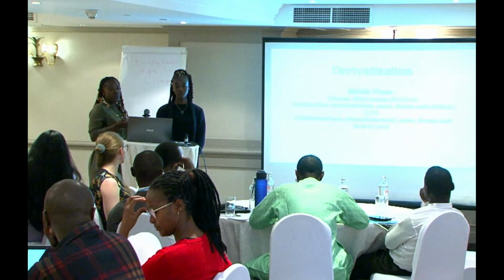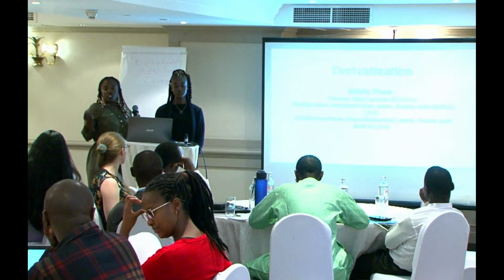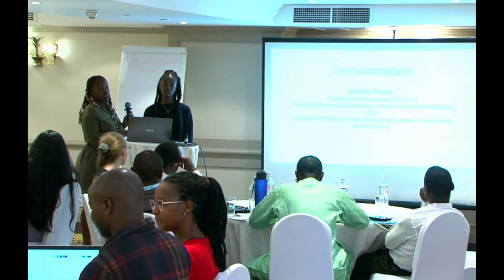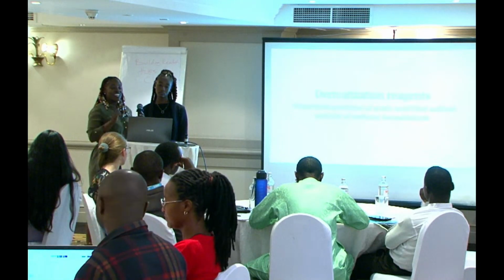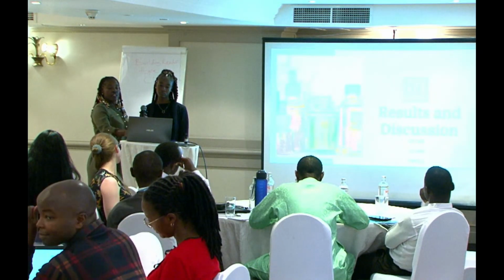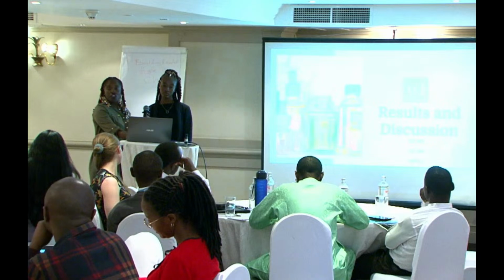And the derivatization process, we had the mobile phase, stationary phase, which we all kind of went through with that really expensive equipment that was given to us. And these were the reagents that we used for the derivatization. And now to the meat and potatoes.